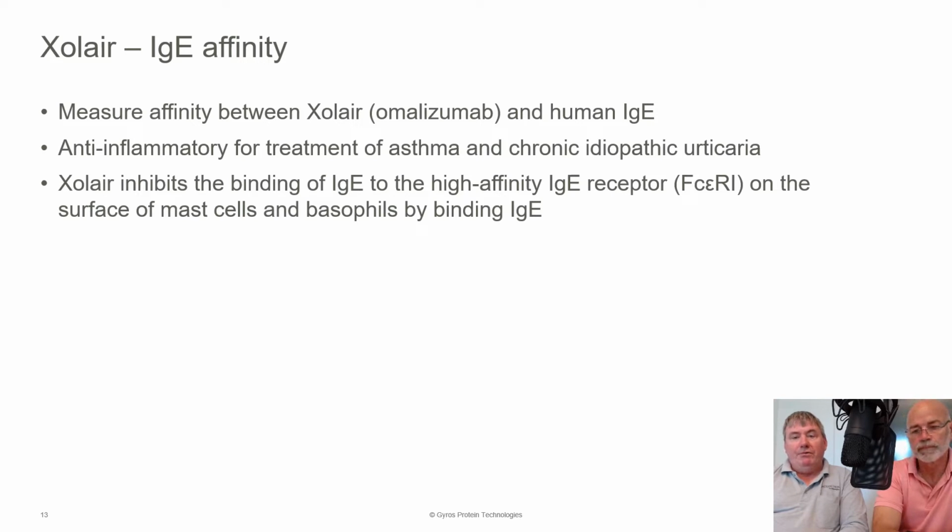Kind of an important part of the affinity of Xolair to IgE is actually it's relatively low affinity. So this has very much become our test system. Because it has low affinity, it means that when we're doing this assay for training purposes, we only need a couple of hours of incubation to reach equilibrium. So it makes it a very good assay for training purposes.